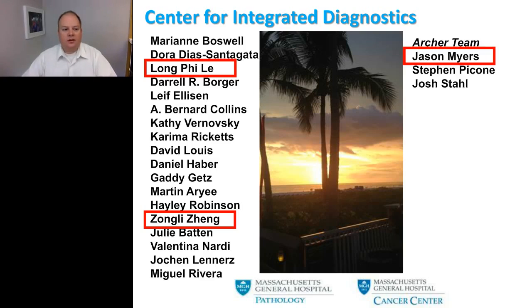Great, thanks, John, for that presentation. We do have a lot of questions, and due to time, we'll answer just a handful of them and address the remaining via email. So the first question: how do I best gauge the quality of my input material? Should I be using a fixed nanogram amount, or is there some other recommended way?